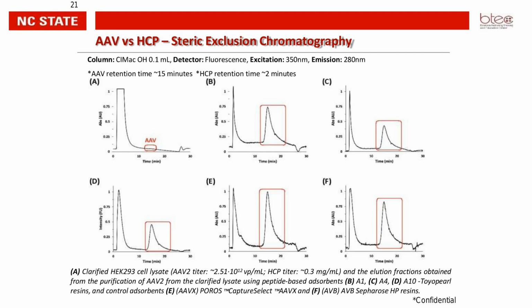Initially we started off with a 30-minute run, and we have now shortened these methods to about 7 to 11 minutes. So in theory, we can quickly get data or information about a sample in about 7 to 11 minutes.